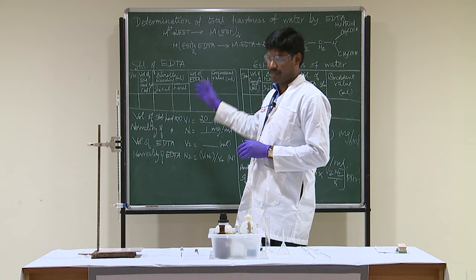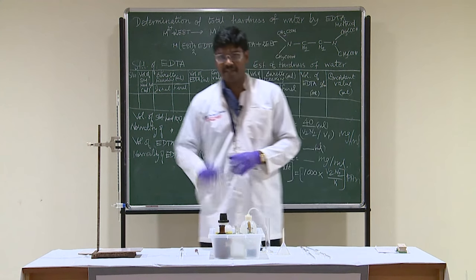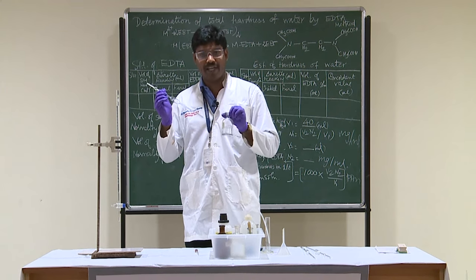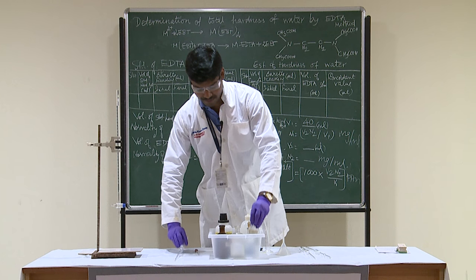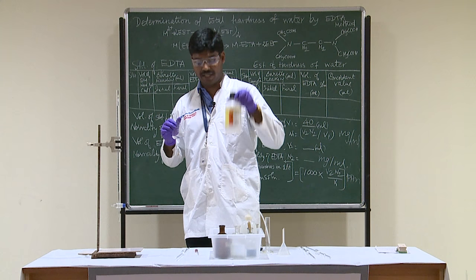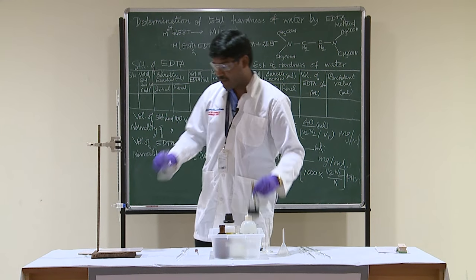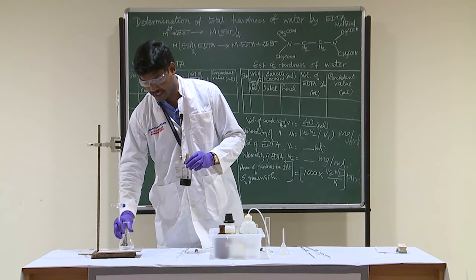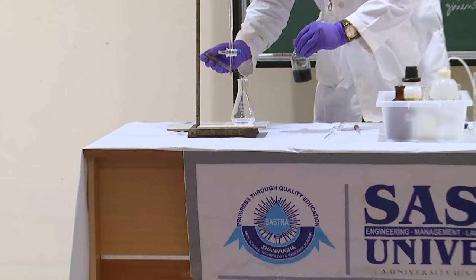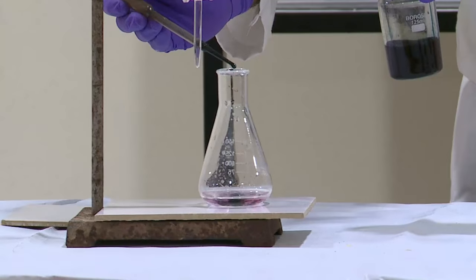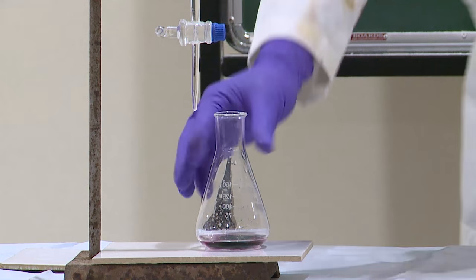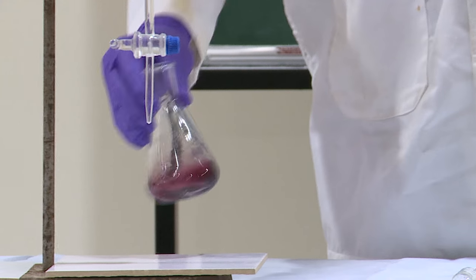The first titration is the standardization of EDTA. Take a conical flask and pipette out 20 ml of standard hard water. I have already pipetted it out. Add 5 ml of buffer solution — it is also added already. Now I am going to add the indicator, Eriochrome Black T — just add 2 drops. The metal-EBT complex has been formed and you can see the wine red color.